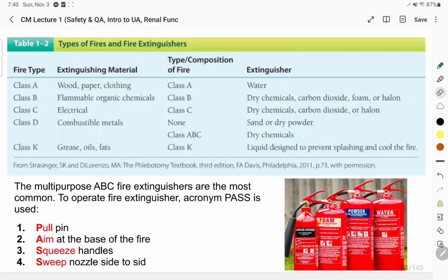Okay, so kanina ang pin. Kanina murag naa sa circle. Tabunan na skillet. Okay? And then, imo nang birahon, parang tangtang na siya. And then, you aim the nozzle. Okay? You aim the nozzle at the base of the fire.